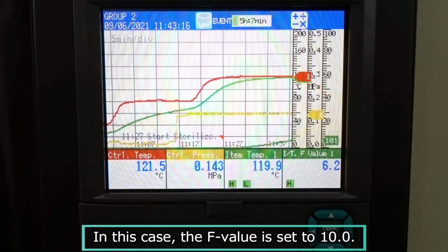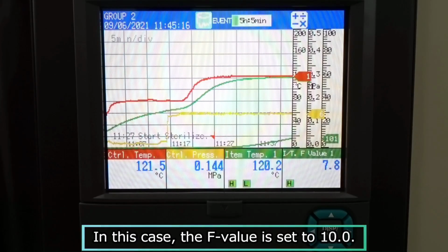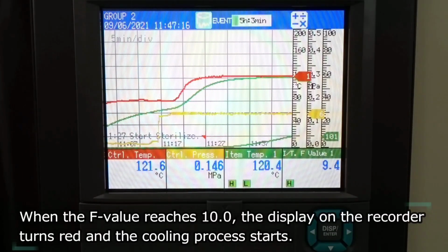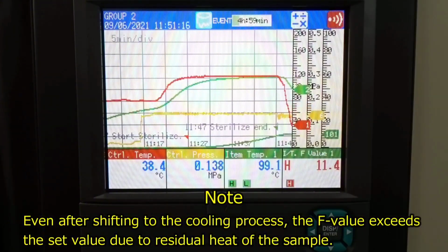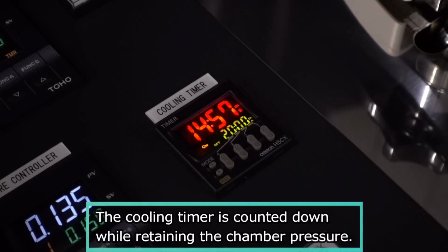In this case, the F-value is set to 10.0. When the F-value reaches 10.0, the display on the recorder turns red and the cooling process starts. The cooling timer is counted down while retaining the chamber pressure.